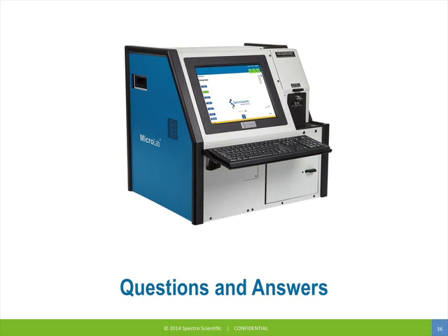Okay. Another somewhat related question: someone's writing here that they service a non-United States military organization, and they want to have some software to collect their data, but certainly don't want it to live in the cloud. Can they have a dedicated version to run on their own server rather than in the cloud service? Yeah, we've actually done that for a couple of non-military customers as well, who are worried about network interruption or hacking or stuff like that. Setting up something on their own server is currently being done, and yes, it can be done in the future as well.